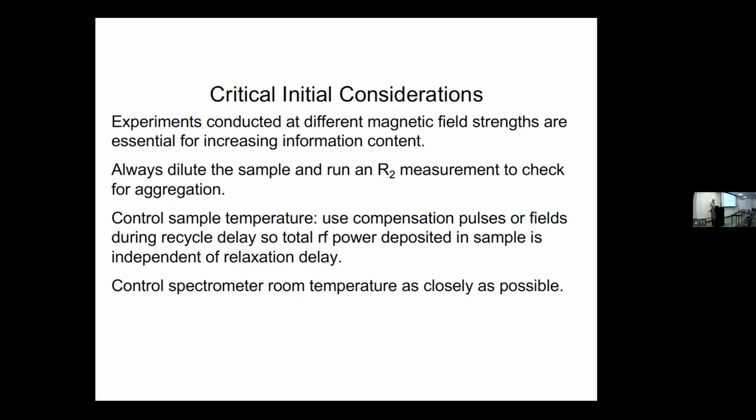So the water line is temperature dependent. So if there are temperature fluctuations, the VT gas gets adjusted. And that actually is something everyone should be doing these days when doing these experiments, if the console supports it. And all the newer consoles support it.